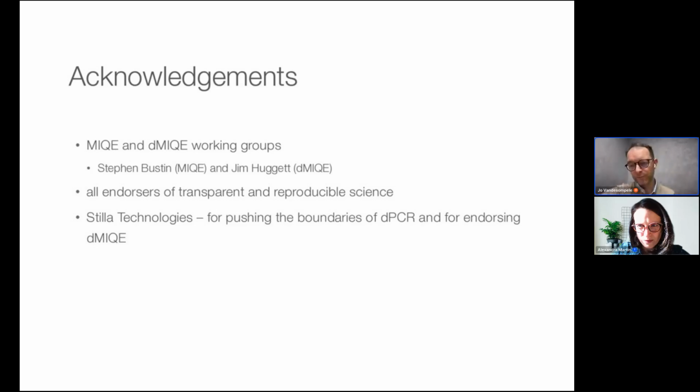And that's where universal probes come in. You keep the number of probes low, to 4, 5, 7, depending on the application and the instrument. You keep the background low, and then you can do higher order multiplexing. But the sequences for the universal probes are, of course, proprietary to the companies that supply them. I hope that answers your question.